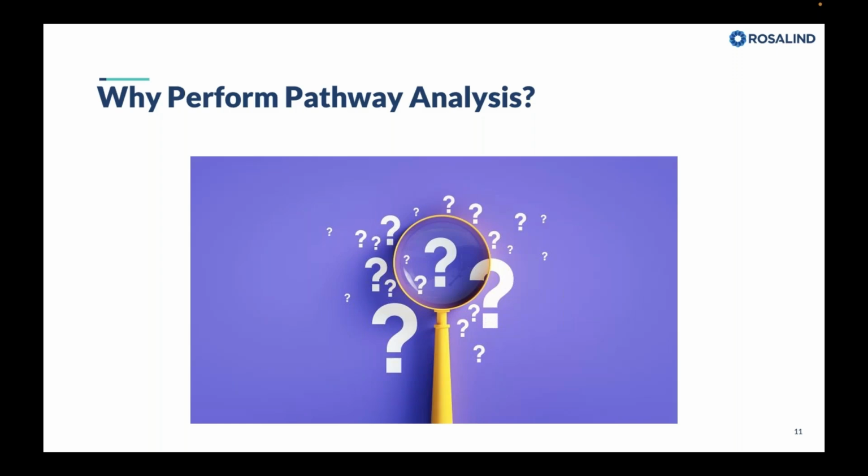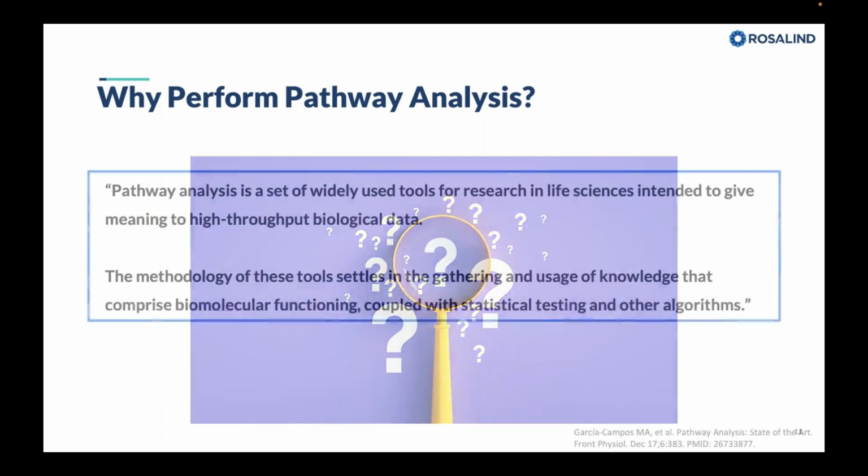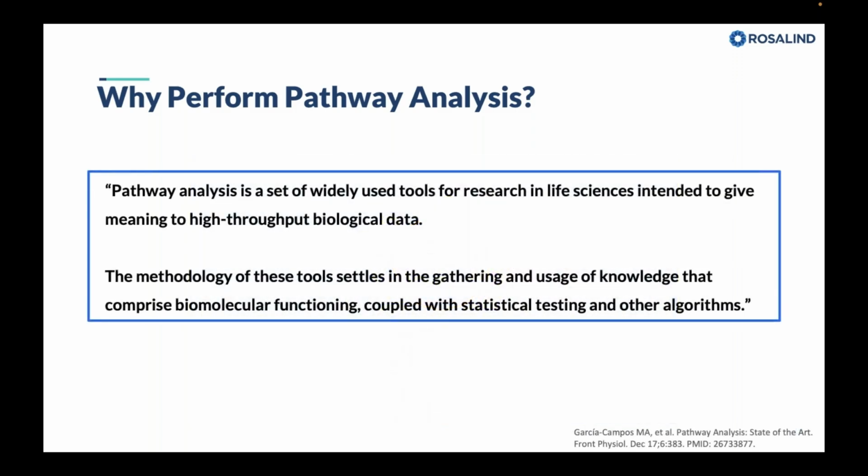was actually a nice quote from a publication that I was reading about the other day. So pathway analysis, at least at the highest level, in my perspective, is represented here with this quote. So it's a set of widely used tools for research in life sciences intended to give meaning to high throughput biological data. The methodology of these tools settles in the gathering and usage of knowledge that comprise biomolecular functioning coupled with statistical testing and other algorithms.